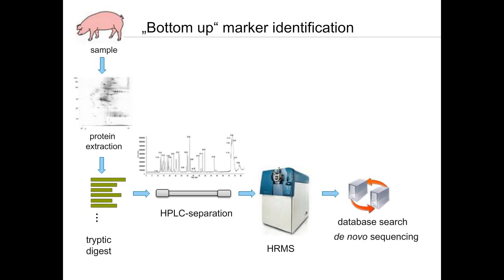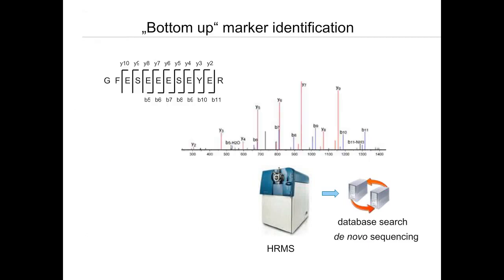to identify as many peptides as possible. And one of the huge advantages nowadays concerning proteomics is that we are able to do this in a highly parallelized fashion, as I'd like to show you on the next slide.